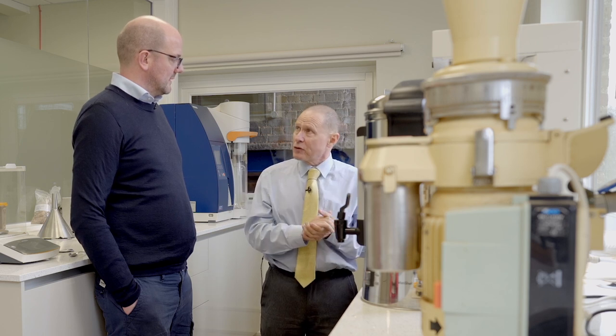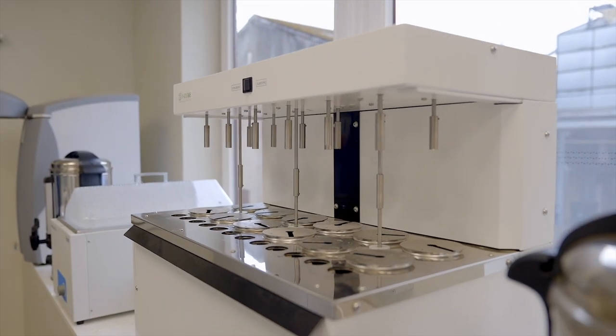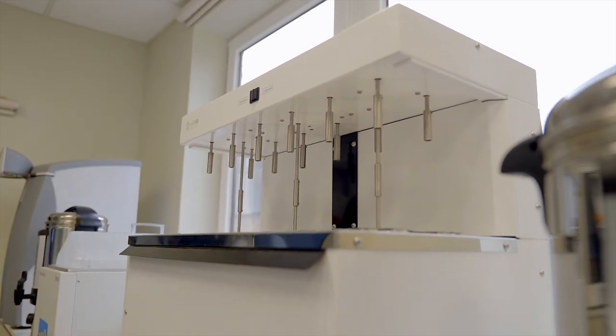We also test for crystallisation on the crystals because some brewers like a certain percentage, and each brewer has a different specification so we have to meet that. So if you do a mash here, what's the purpose — you're checking the extract? Yeah, we're checking the extract but also the colour. The extract can be converted into a specific gravity, and that will help the brewers — they just do a calculation. But we've also got a density meter that can do it. That liquid being filtered would be used for colour as well as extract, measured through the density meter for extract and specific gravity.